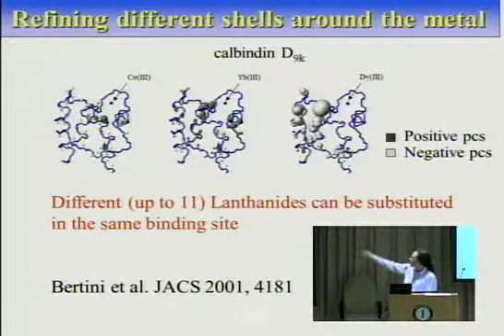So you get different effects in size, that is the size of the spheres for the same atoms. You see this Lanthanide is inducing much larger shifts than this other one, but also you get a difference in sign of the pseudocontact shifts. Here you have negative values, here you have positive values, because the spin-orbit interaction is different in the different lanthanides.